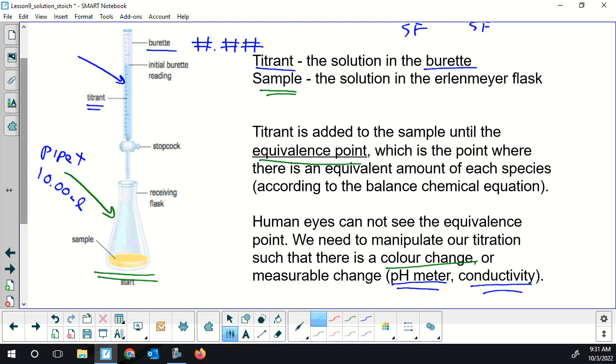Systematic error would be you pipette and you didn't rinse it very well and there was a contaminant in the pipette. There was a bunch of acid and then you sucked up base and it neutralized 10% of your chemical that you wanted. By doing repeated trials, you're going to see this one trial is 10% low. And you could potentially exclude it. If you do 4 trials and you get 1.1 moles per liter, 1.2, 1.1 again, and then 0.8, you'd be like, why is this one trial so low? Some type of systematic error must have happened. And you would want to exclude that from your data.